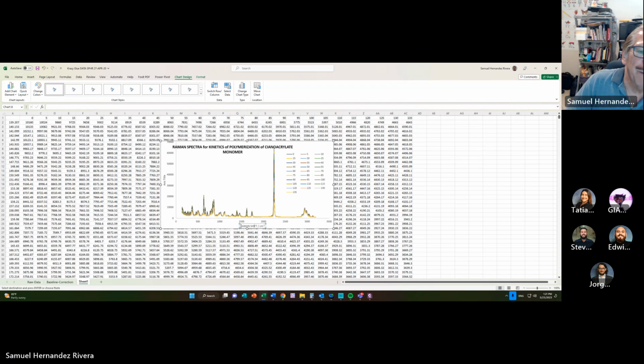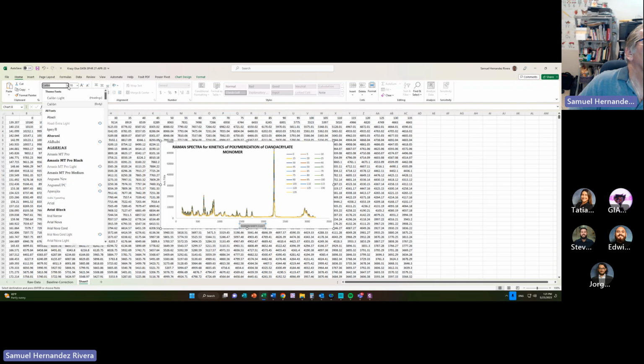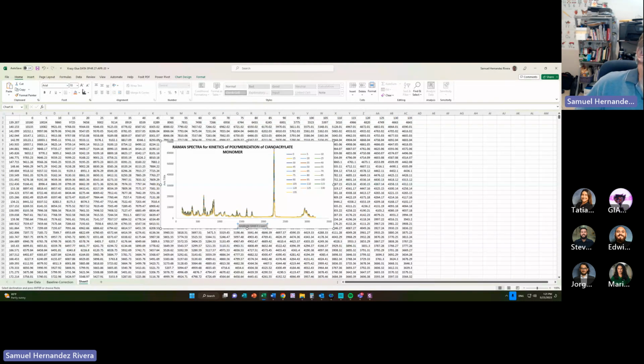Next, I'm all for Arial, so we go to the fonts and we specify Arial. We tell it that we want it at point 14, so it'll be big and easily recognizable. Again, the font color we use as black as we can.